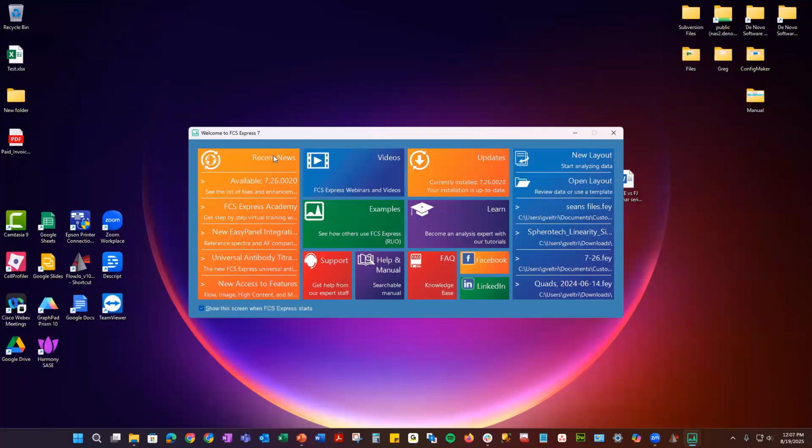So let's talk about the recent news. Recent news is going to talk about what versions are available, and FlowJo has this also. And then we also have FCS Express Academy. So we have a free academy that allows you to go interactive with the software, and it's a tutorial to teach you how to use our software. We have an easy panel integration that just occurred, and then you'll see we have a universal antibody titration, and then access to new features. So this is a nice area. If you're just wondering what's going on with FCS Express, we place that there.